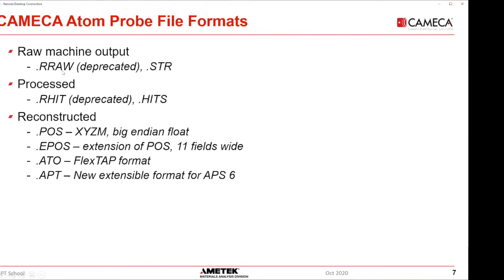The R files, these ROOT files, are compressed, and the larger they get, the longer it takes to rewrite them with compression. If you have a large run, it basically consumed your entire CPU trying to write these. So we just went away from those.